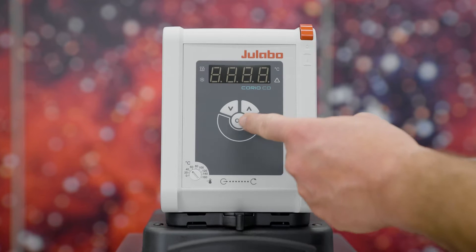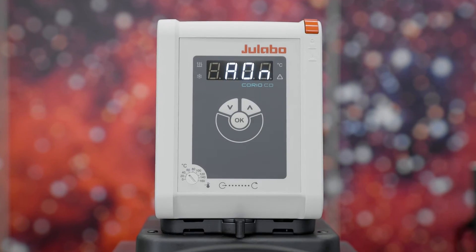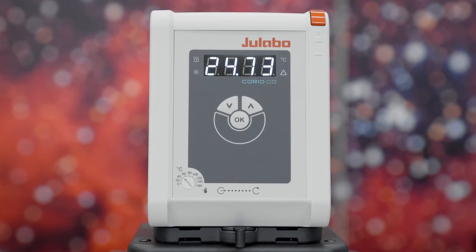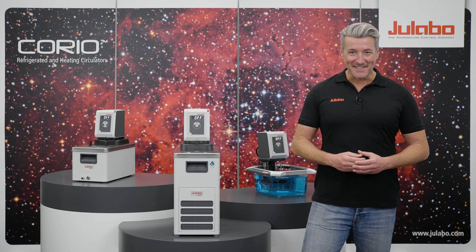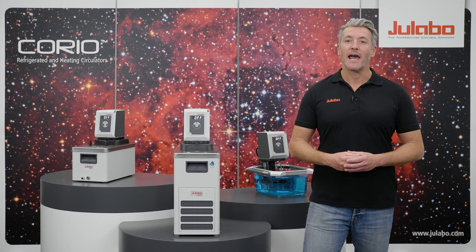Even the activation is simple. Turn off the Corio, then just press the OK button and the power switch at the same time until the device is switched on. The display shows 'A on' for AutoStart on. To deactivate the AutoStart function, repeat the procedure until the display shows 'A off'.